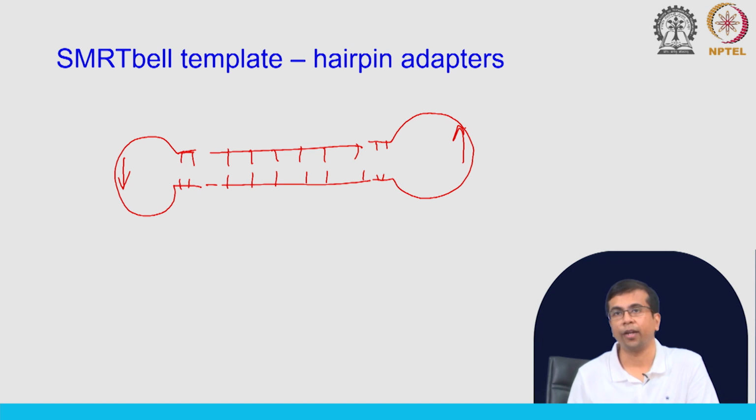This is where your primer can bind and then sequence the molecules. So you can probably now guess that this is a sequencing by synthesis method. You have the primer, you have polymerase and you have dNTPs, which will then synthesize the complementary strand, and in the synthesis process it will identify the bases.